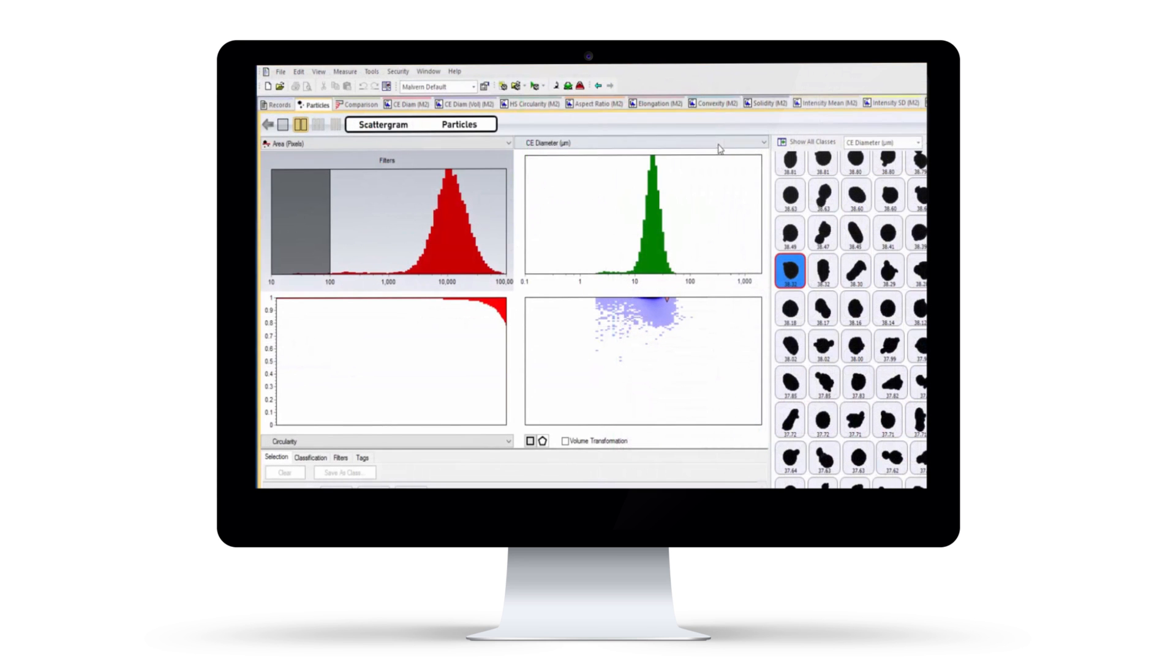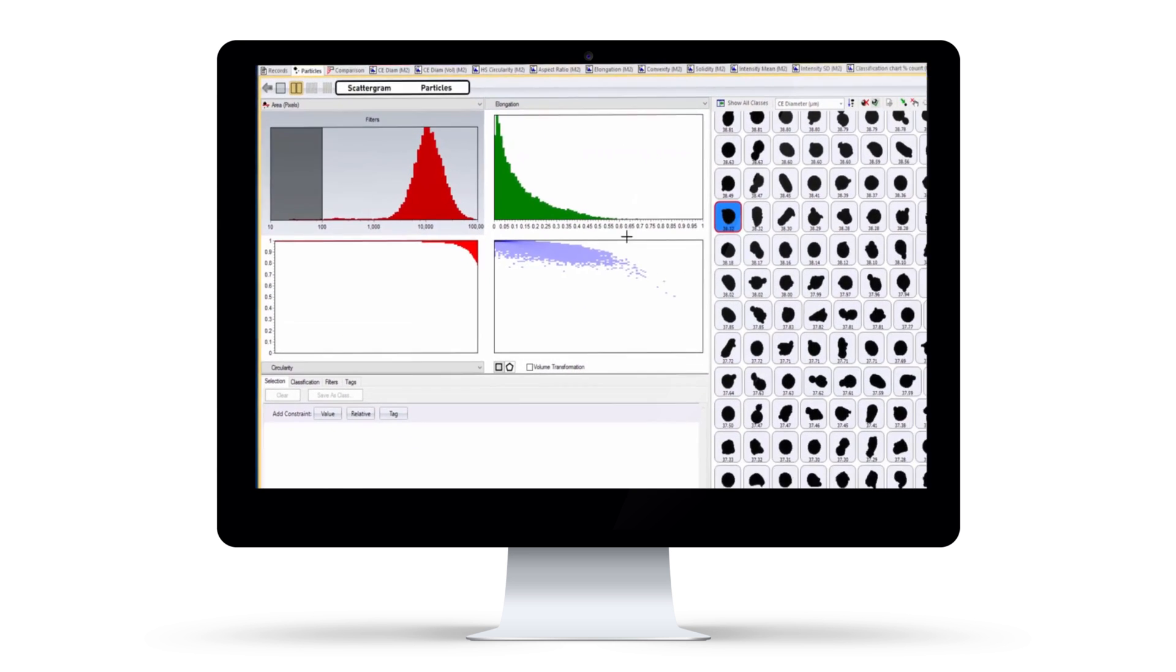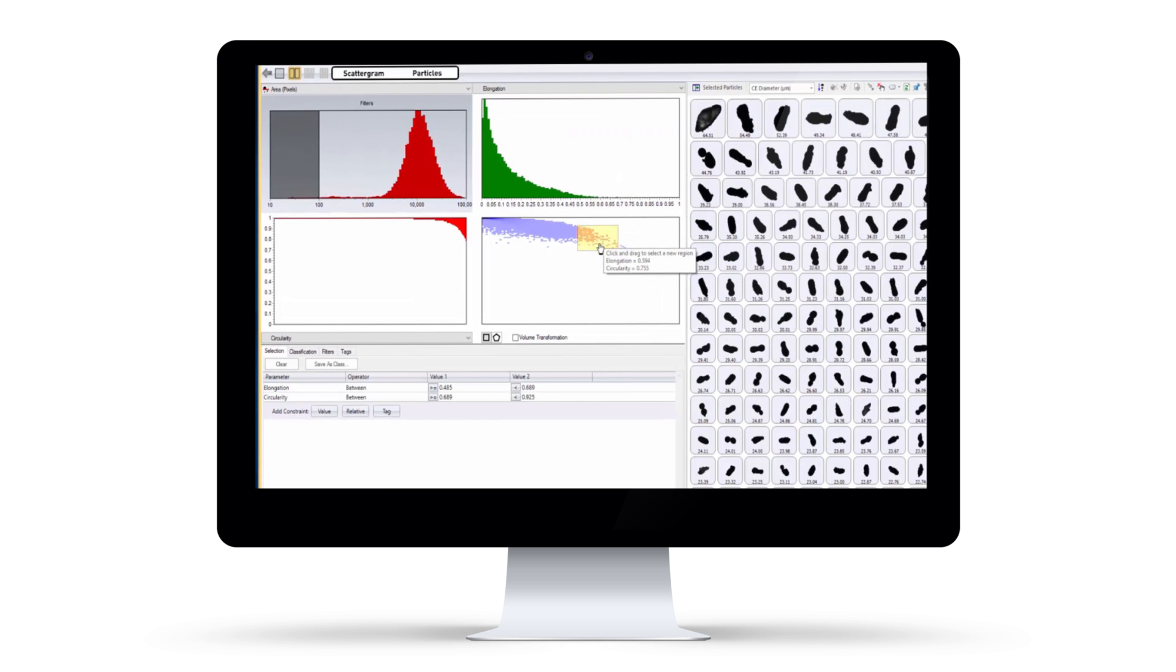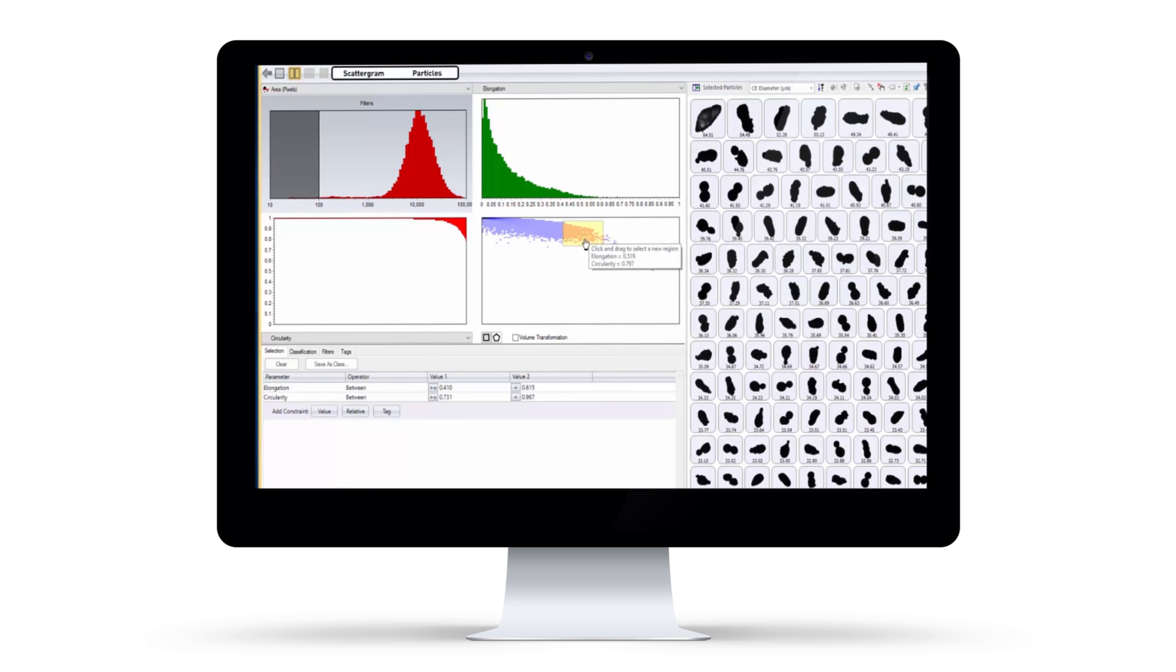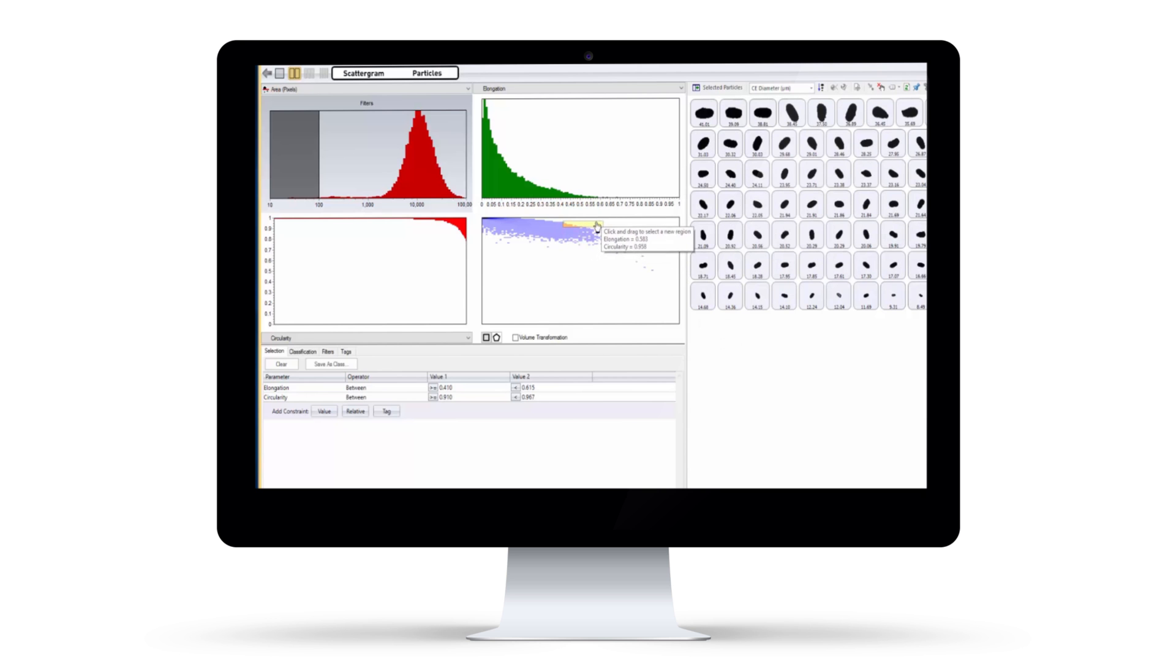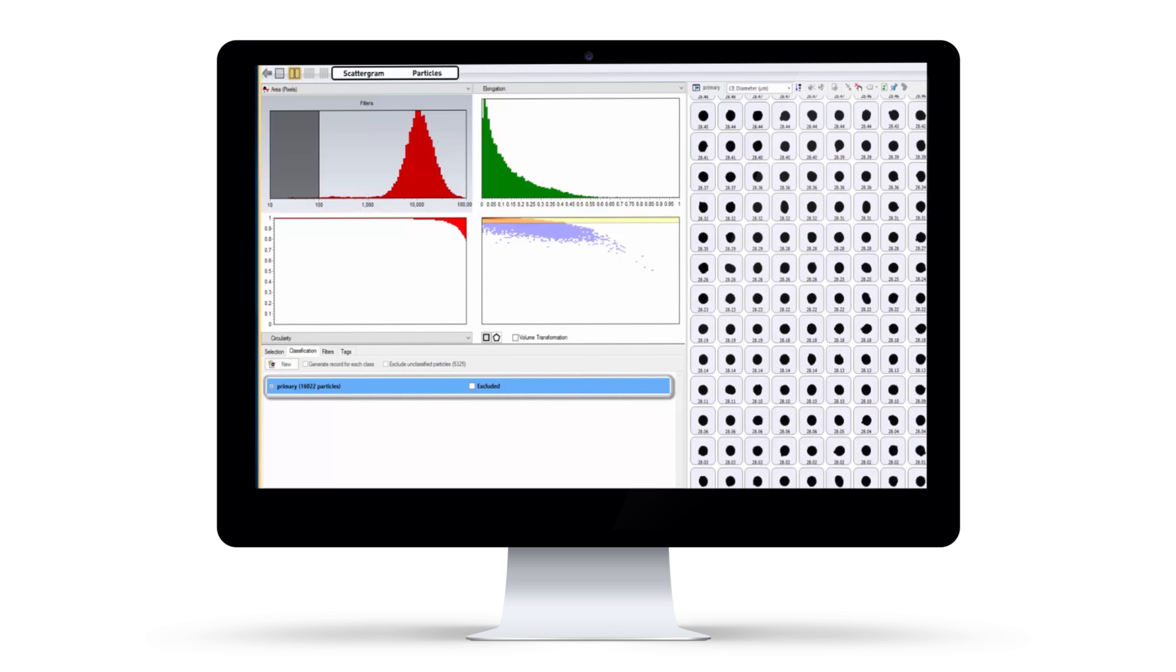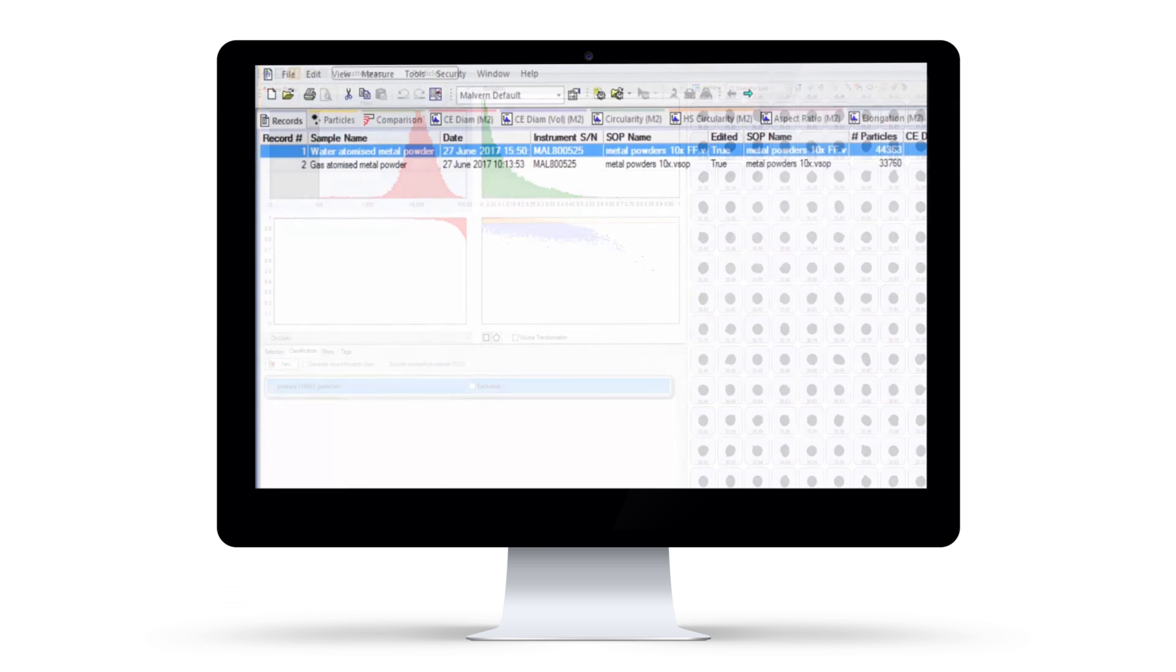The software makes reviewing this wealth of data quick and simple. The ability to view individual particle images against a scattergram of any two size and shape variables enables you to see morphological patterns in your data and visually classify different components within your sample.